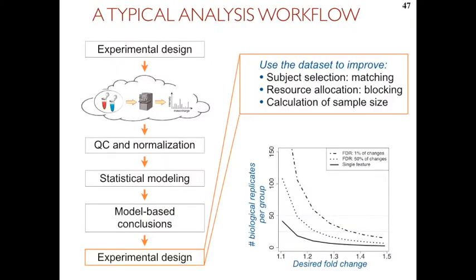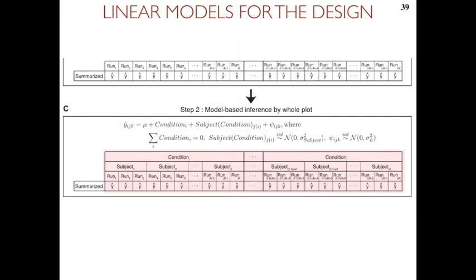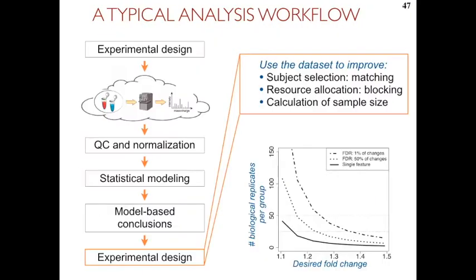And of course, the experimental design. Now that we have done this, let me go back to the summary table. This is where we can look at the variance decomposition and see how much biological variance we have in our data, how much technical variance between technical replicates we have, and we can learn all of these variance components. And then we can actually provide some estimates of how many replicates we would need for a follow-up experiment, which would have the same type of biological system, the same type of experimental design, and the same type of measurement technology. We talked quite a bit about this last week.